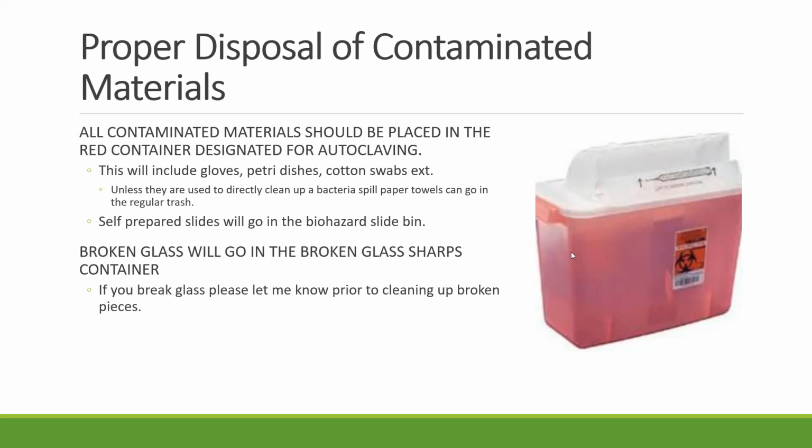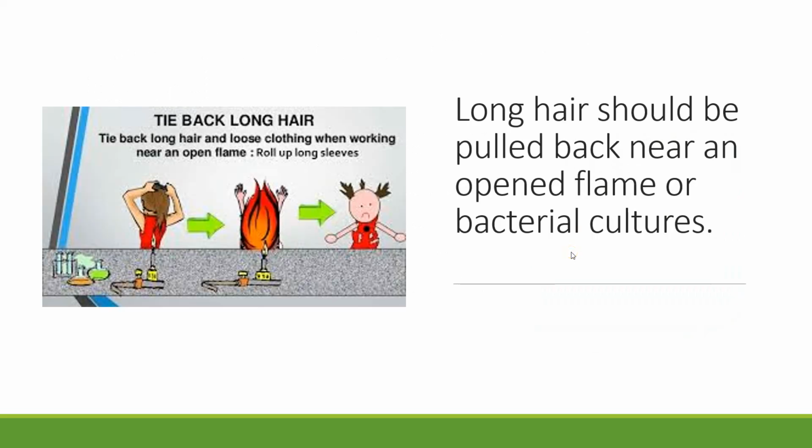Things that are glass in nature, so slides, etc., go into the sharps container just like any needles would. And broken glass, of course, would go into the glass containers. But if you're in a lab setting or patient's room or something, if you break something, always notify the lab director or the charge nurse or something, to make sure that there's not more that you need to do than the traditional cleanup.